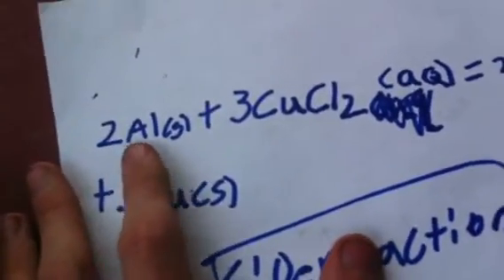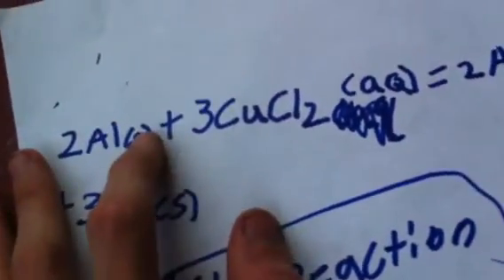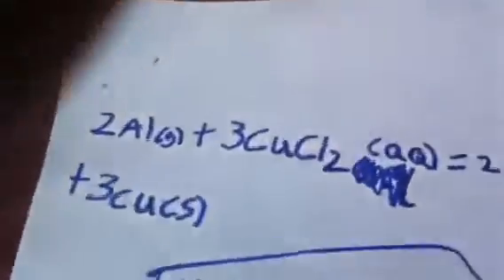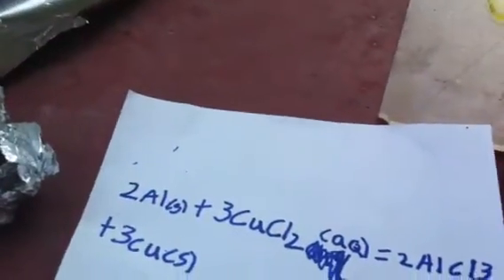But you have two aluminum, which is in solid phase, which when you add the copper chloride to it, which would be aqueous or dissolved in water or your solvent. In my case, it is water. And let me catch this on fire again, so I'm not breathing in all these extremely toxic fumes.